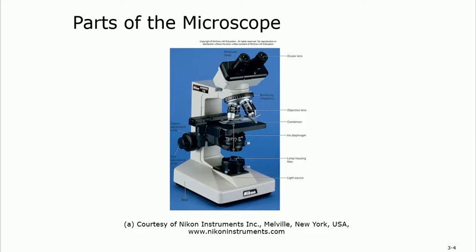This is the slide that you'll be using for the light microscope. This part here is the adjustment — the big one is the coarse adjustment and this is the fine one. You do the coarse first until you get the slide close enough and start to see a little bit, then you do the fine adjustment to see the details. You also have an iris or diaphragm, which controls how much light passes through to the specimen on the slide. There is a light source at the base.